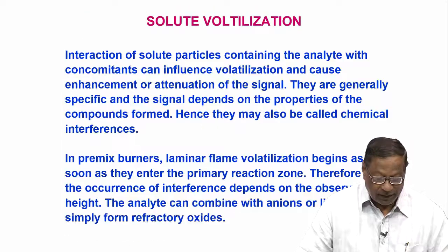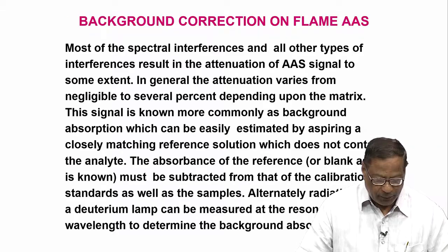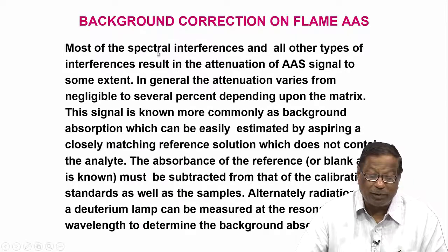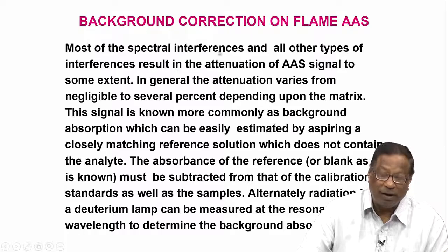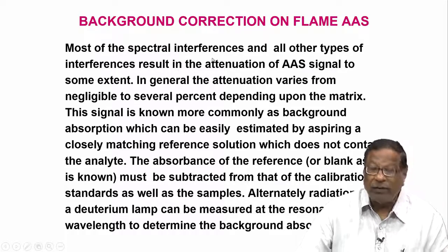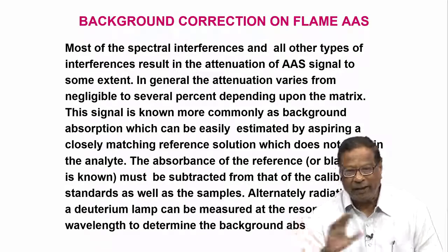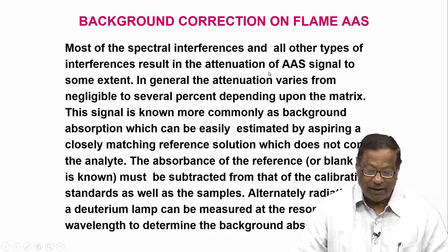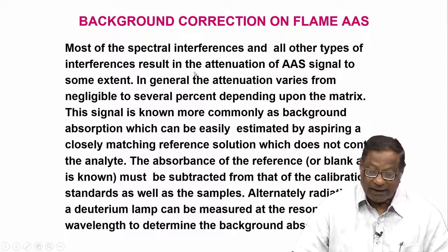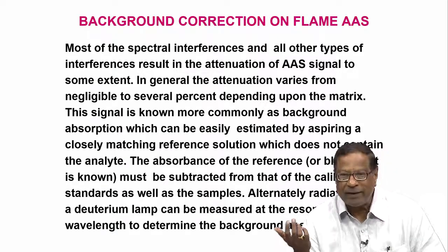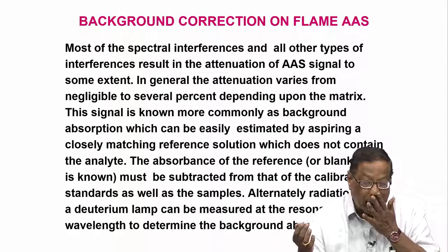We have discussed all these things in detail, and now we will consider how to correct some of the interferences that occur in atomic absorption. This is called background correction in flame atomic absorption spectrometry. Whenever there is a change in the absorbance due to any extraneous factors, we correct those extraneous factors so that the signal remains intact. Most of the spectral interferences and other types result in the attenuation of the atomic absorption signal. Any reduction or increase in absorbance more than 10 percent is called an interference.